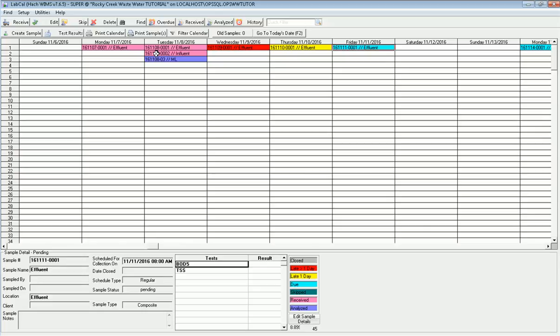As you enter results into LabCal, those results go into variables in the WIMS database. Let's take you through the setup of a sample, how to set up the test for it, the methods, and how to schedule a sample and link it to your WIMS variables.